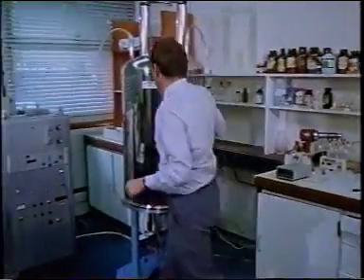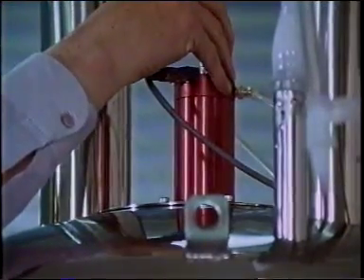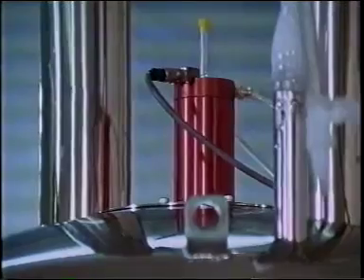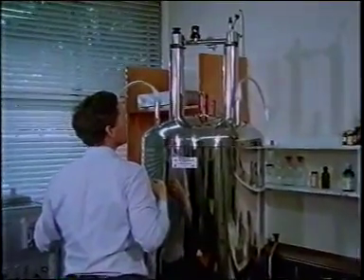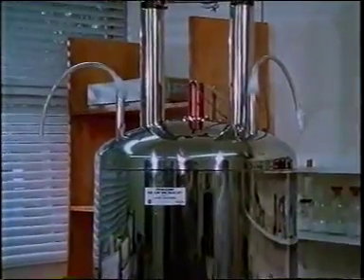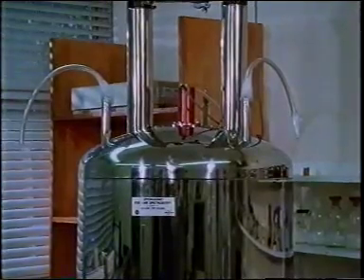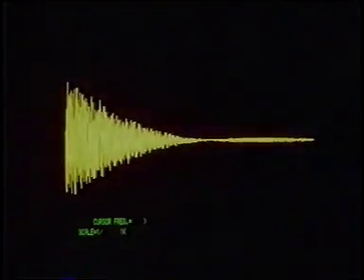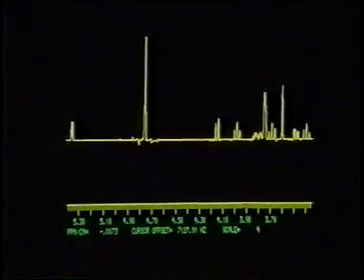Once placed carefully into the instrument, the solution is exactly in the middle of the magnetic field, and jets of air directed against the spinner rotate the tube. This effectively increases the uniformity of the magnetic field because the spinning action ensures that molecules experience an average field. This is the FID for sucrose. And here is the corresponding conventional proton NMR spectrum.